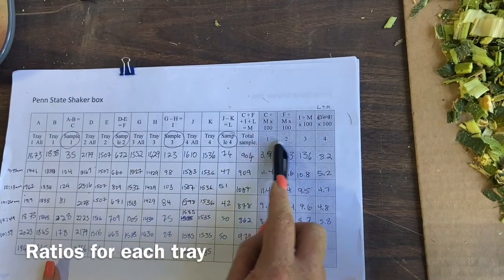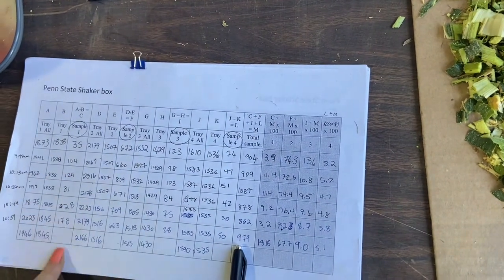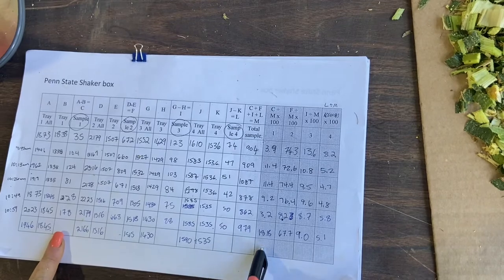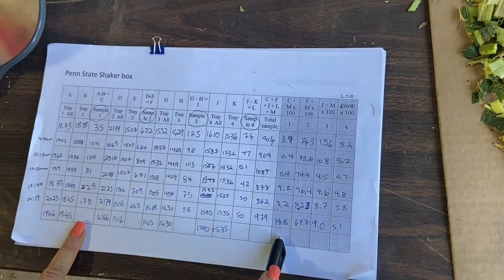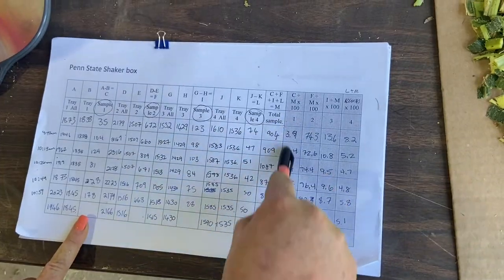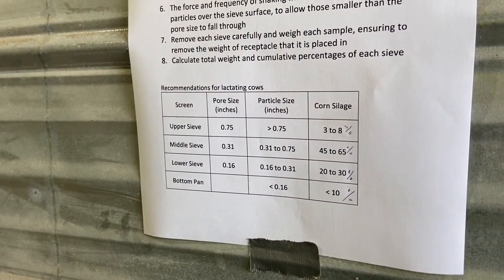To get the ratios, you take the sample on tray 1 divided by the total, times 100 — that gives you the percentage on tray 1. For corn, the top tray we want between 3 and 8%. That's the one we care most about. Here are the targets we want to achieve.